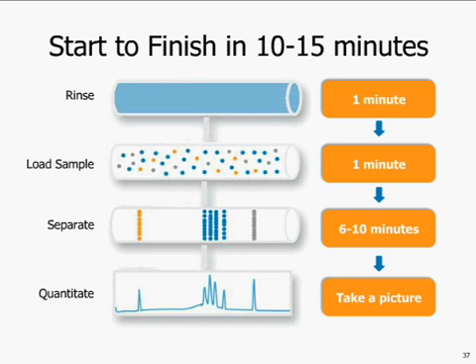Once the capillary is loaded, the sample and the amphoteric components are focused with the application of an electrical potential for a typical range of 6 to 10 minutes. During focusing, images are taken of the capillary every 30 seconds, with a final image taken at the end of the focusing period.